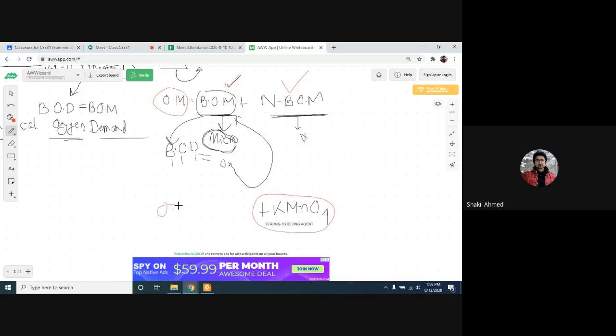So organic matter plus potassium permanganate plus oxygen is degradation of all types of organic matter.